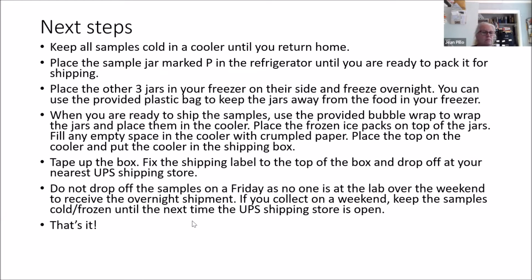So next step, keep your samples cool or in the cooler until you get back home. You're going to take the jar with the P on it or taxonomy written on the lid, put that one in your refrigerator until you're ready to ship it.